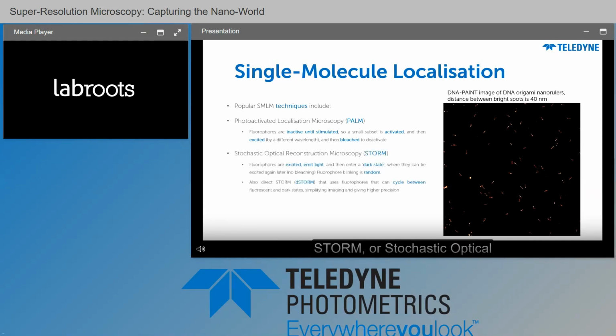STORM, or stochastic optical reconstruction microscopy, where fluorophores can be excited, and they emit light and then enter a dark state when they can be re-excited. The fluorophore blinking is random, hence stochastic. There are also many variants of STORM, including direct STORM or D-STORM, which uses fluorophores that can cycle between fluorescence and dark state, simplifying imaging and giving higher precision.